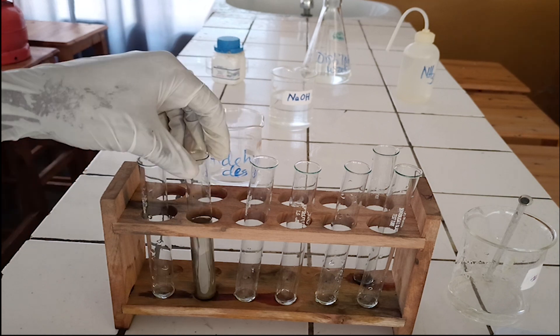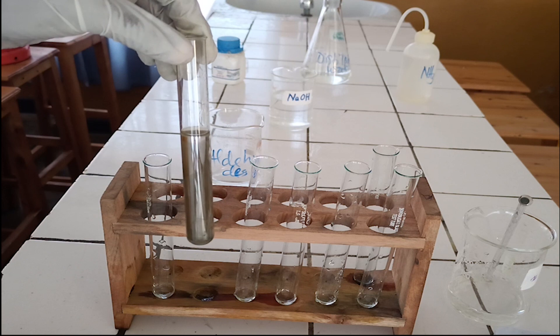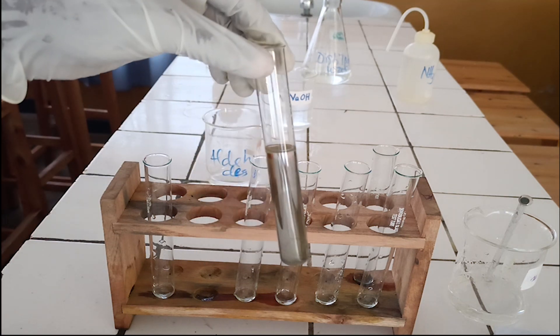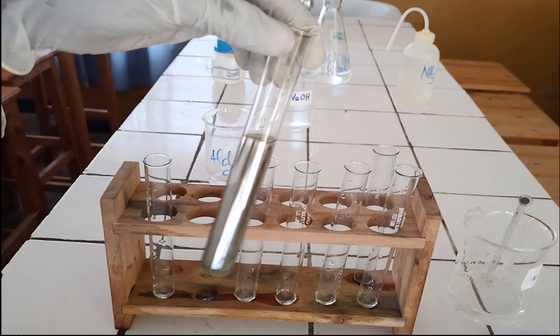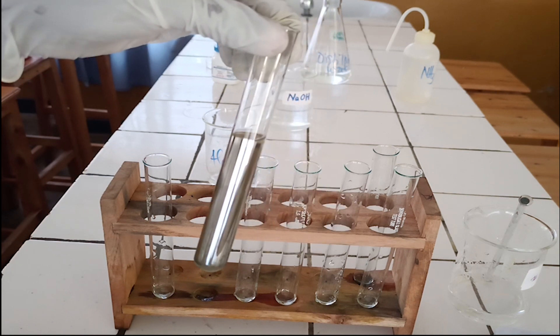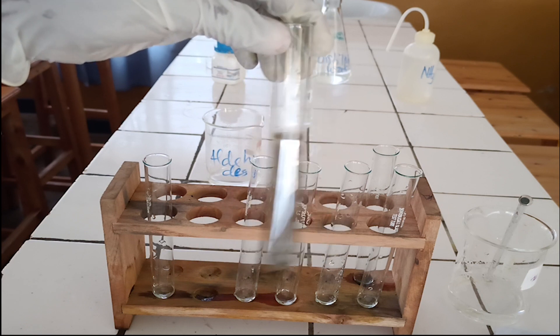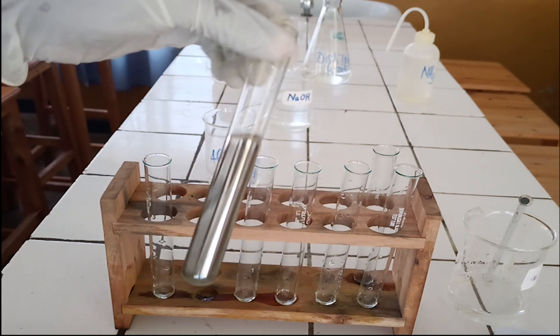As you see, the colorless solution produces a silver mirror on the wall of the test tube. The formation of a silver mirror on the wall of the test tube is a positive test. The formation of a silver mirror on the wall of the test tube indicates that the analyte solution contains aldehyde.